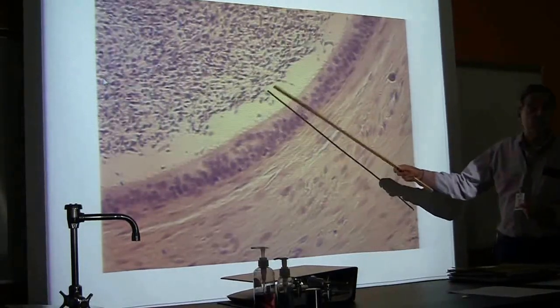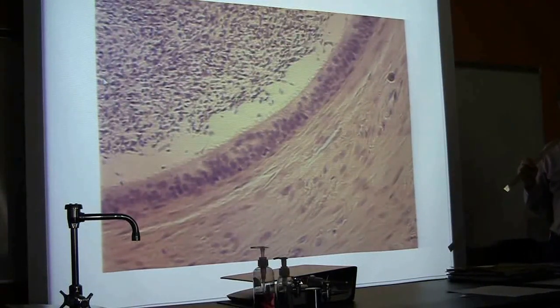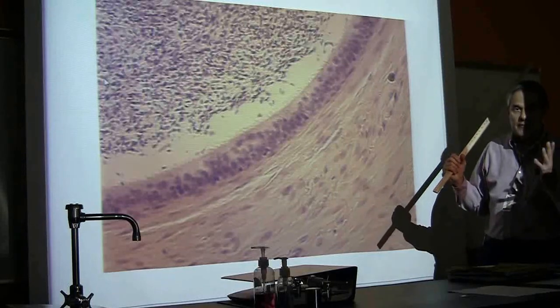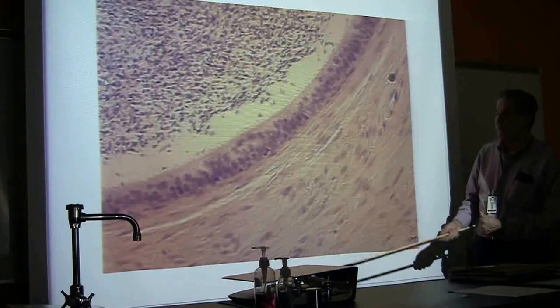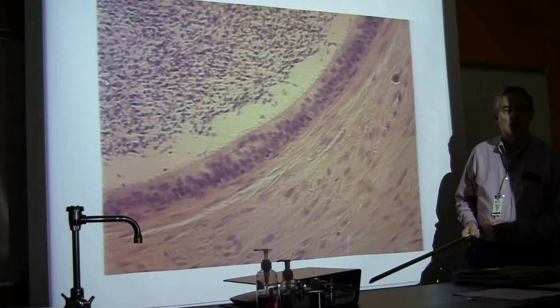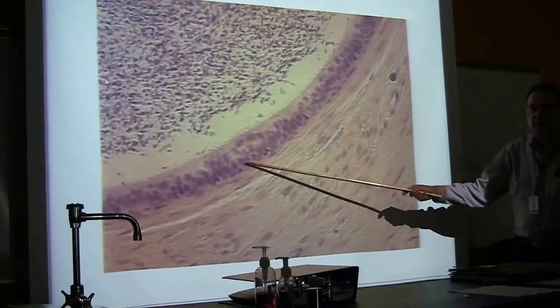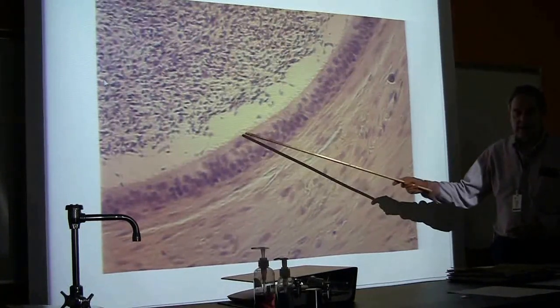Their function is not to move the sperm like cilia would do. It's to provide nutrients for the sperm and to absorb excess water from this mass. Again, the sperm are going to be in the body of the male for a while. You've got to keep them viable by providing the nutrients. So again, these are microvilli, stereocilia, not for moving the sperm, but to provide nutrients and to absorb excess water. So you can see a sperm cell right here with its flagella. So again, the epithelium is pseudostratified columnar epithelium, but not ciliated, as it would appear.